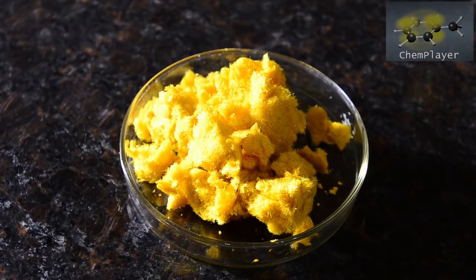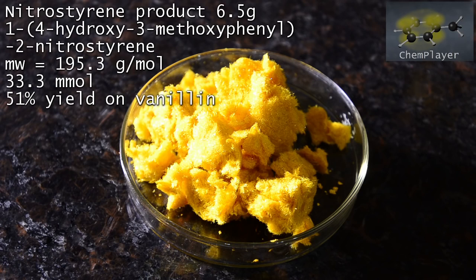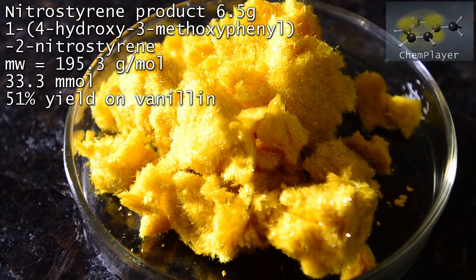Here's the final product. 6.5 grams of bright yellow fluffy crystals with the texture of a fine sugar floss. They fluff up and so the volume is large compared to the actual weight of solid. This is a final yield of 51%, which is on the low side, but is comparable to some of the more reputable reports we could find.